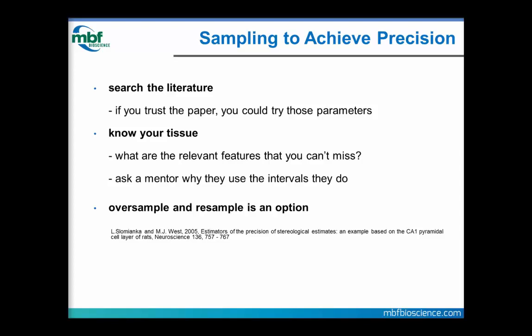Keep an eye on the peaks of the data. If there's a group of cells that you never want to miss, like a clump of them, don't make the section intervals such that you could miss those cells.